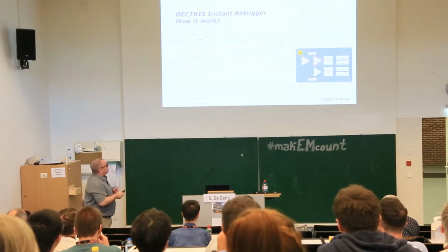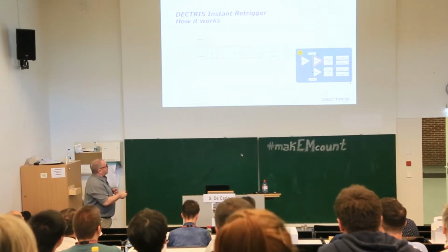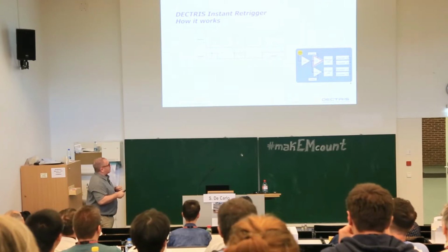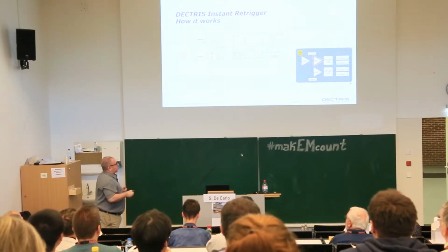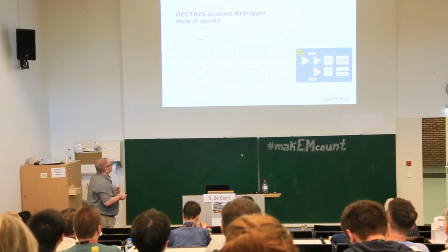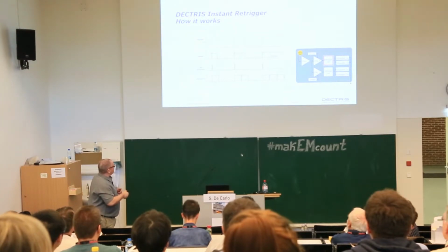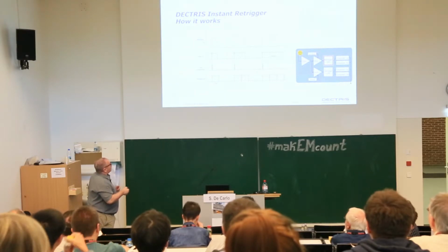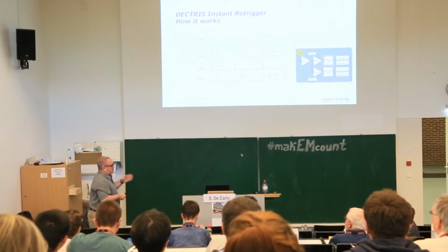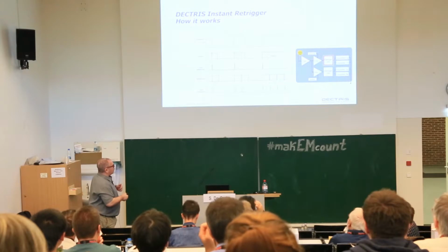So what the logic here tells you, just to explain one more time, is that we have this paralysis situation, and when the flux is really, really high, in the multiples of mega counts, then your counter can only count once and never comes below this threshold. So the idea of introducing these retrigger units is to avoid this paralysis: you reset the in-pixel electronics such that the counter can then count multiple times. And during the time where the signal is above the threshold, you just need to count the number of times this retrigger unit is activated. So here you have an ability to correct the count rate.